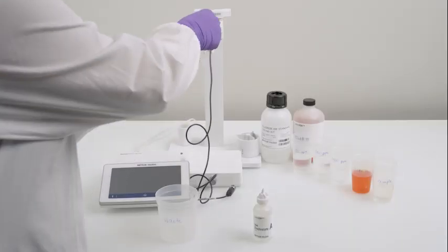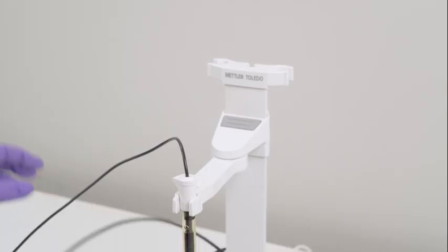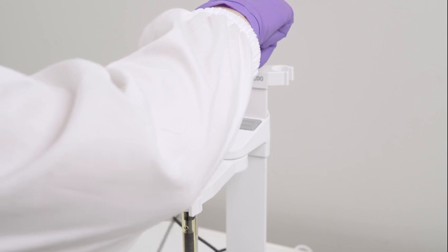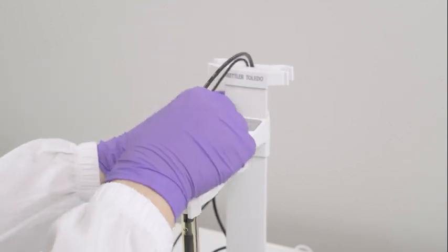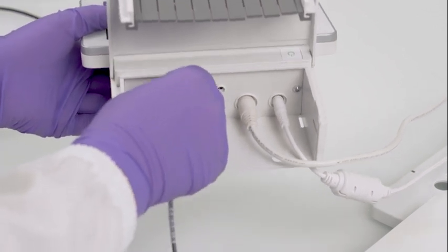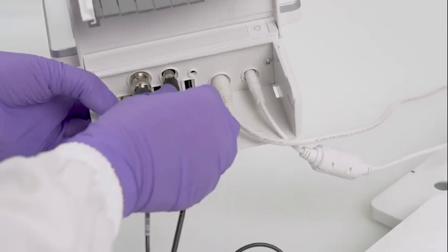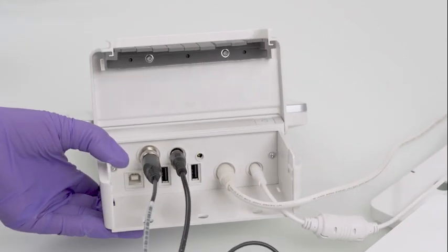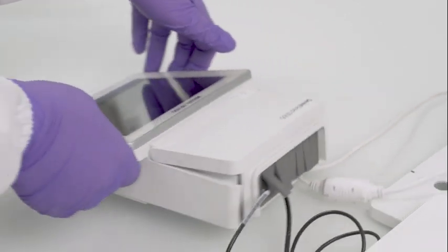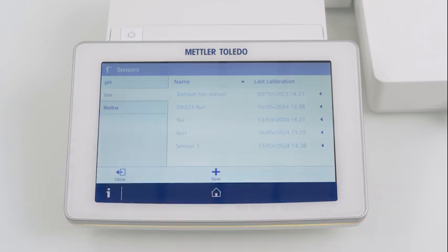Now it's time to attach the BNC connector to the instrument and rotate it until it snaps into place. Don't forget to connect the temperature sensor and stirrer as well. It's also important to check and define the instrument settings correctly to ensure accurate readings.